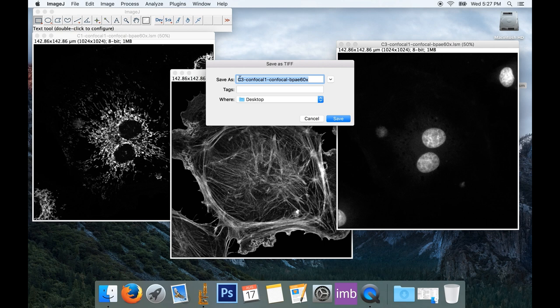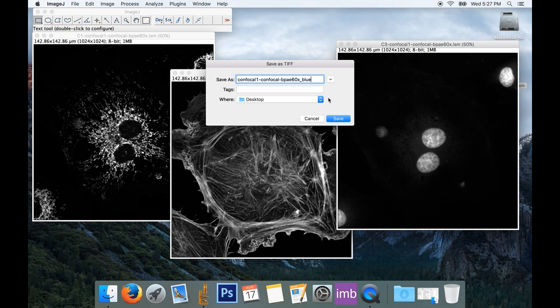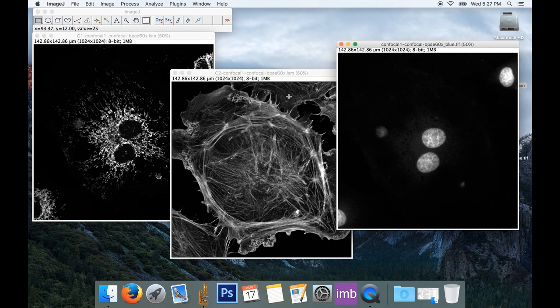And we'll save this. And I don't like their naming convention, so I'll change it to something else. And I want to know that this is my blue channel, so I'll call it Blue. I'll just save it on the desktop.